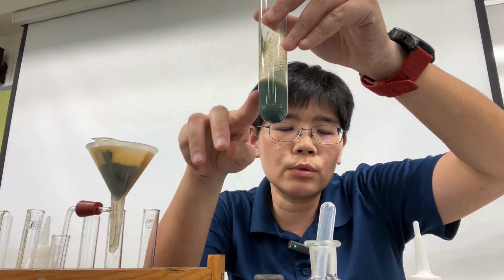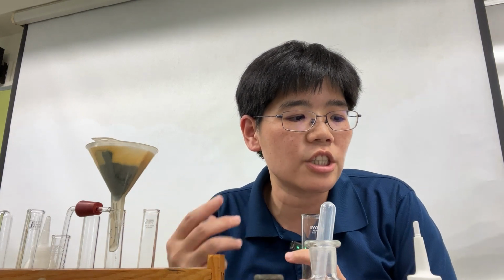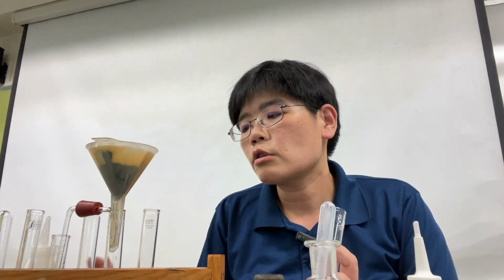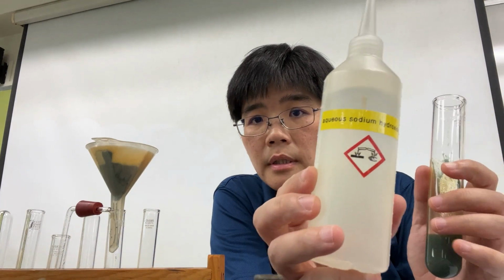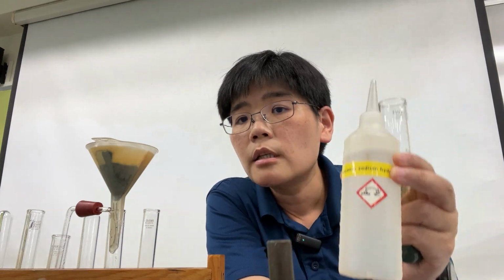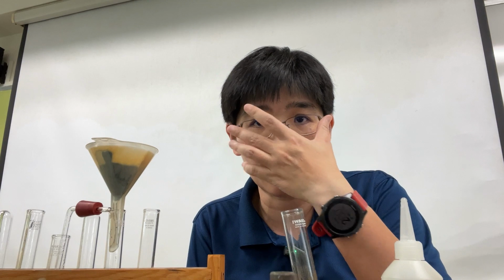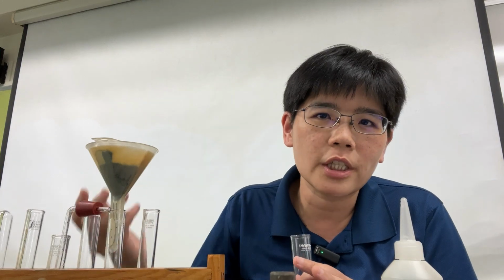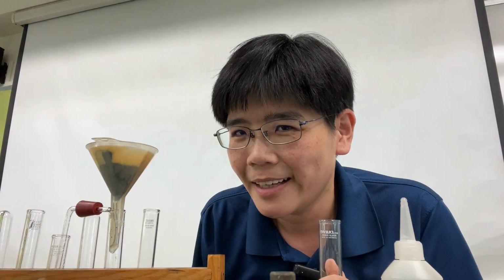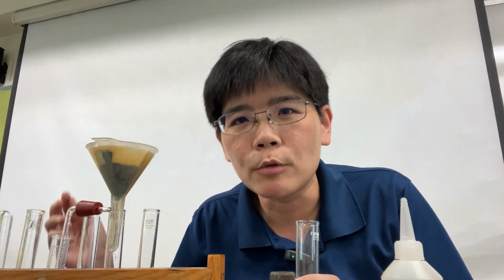So I've already added the further 2 centimeters depth of aqueous sodium hydroxide, and then it says, and gently heat the mixture until it is almost boiling. So the instruction is telling me to add sodium hydroxide, which I have, and then heat it. These two steps together, adding sodium hydroxide and heating, are the test for ammonium ion. The positive result is the production of ammonia gas.